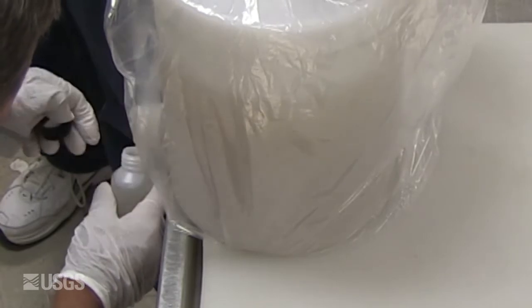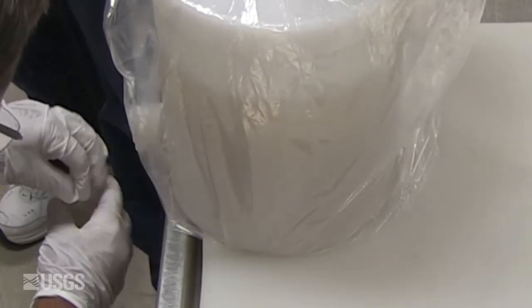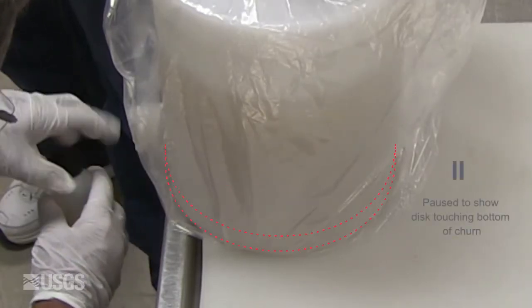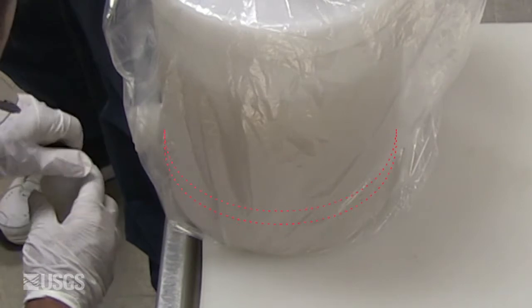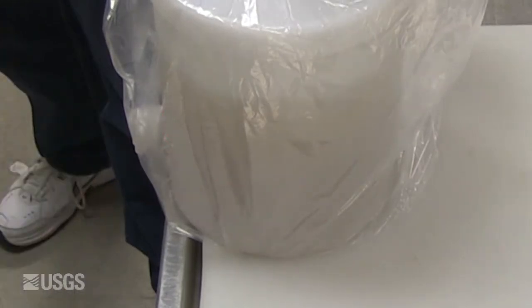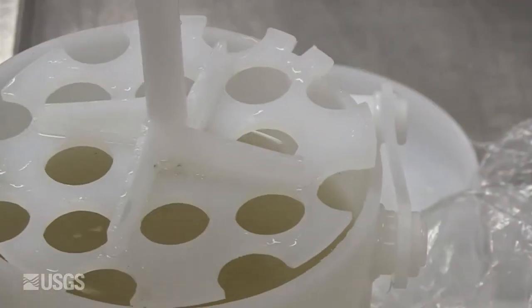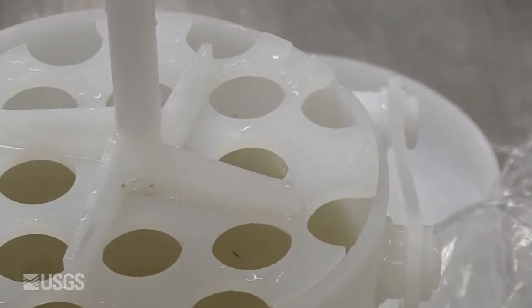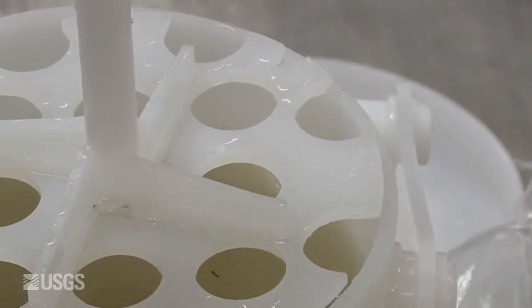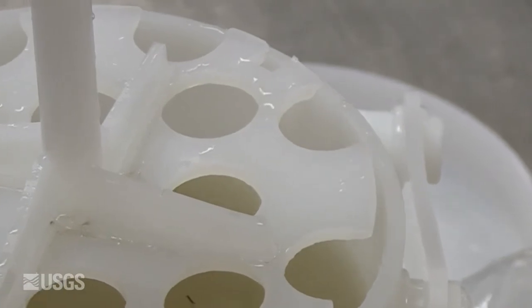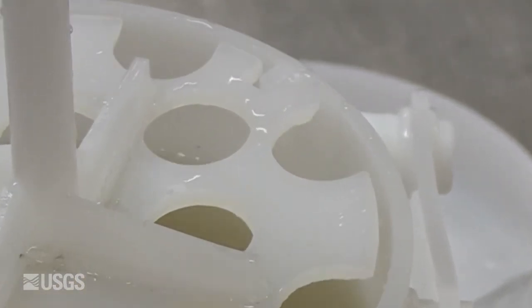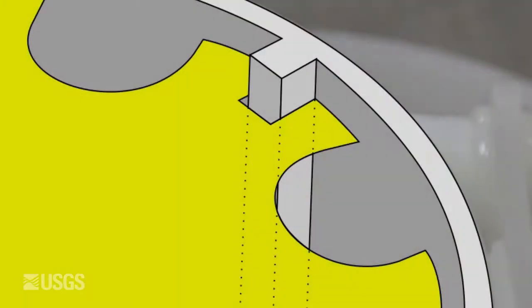When churning, the disc should touch the bottom of the churn on every stroke and the stroke length should be as long as possible without breaking the water surface. For proper disc alignment, insert the disc with the groove mated with the alignment guide inside the churn.